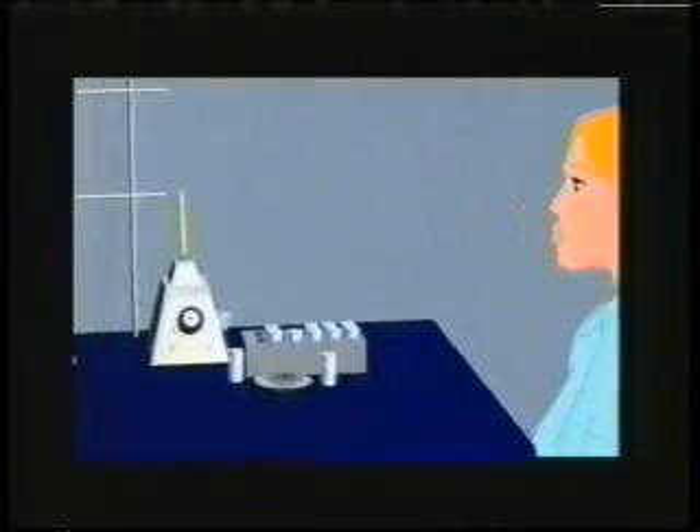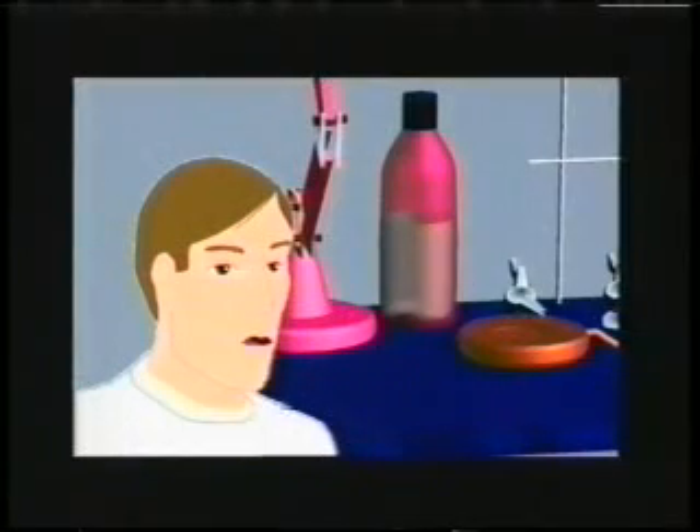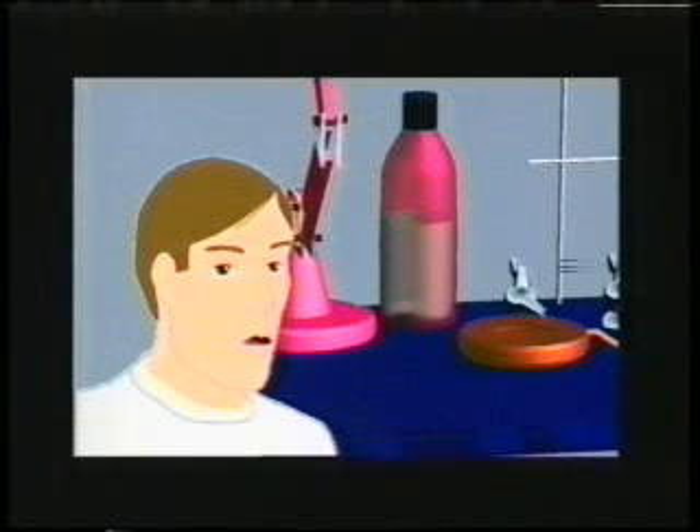Todd, what's with all this stuff? Well, B, you can use this equipment to measure the melting point of a solid compound. That's the temperature at which sufficient energy is available to break apart the crystal lattice structure and the solid changes to a liquid. This physical property of the solid will help assess its purity and also its identity.